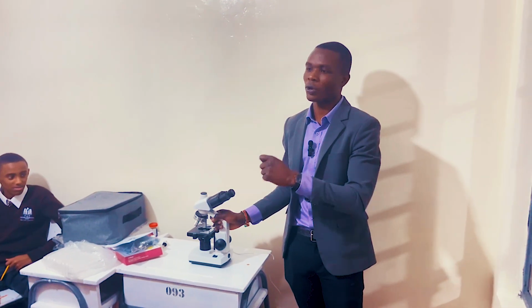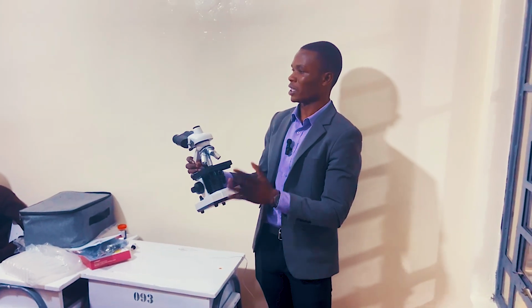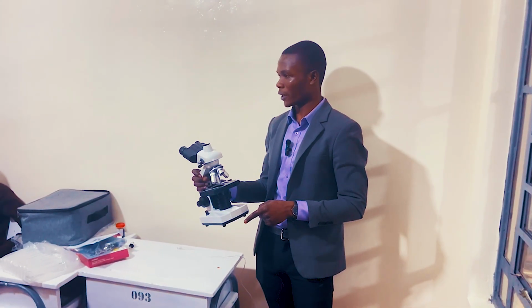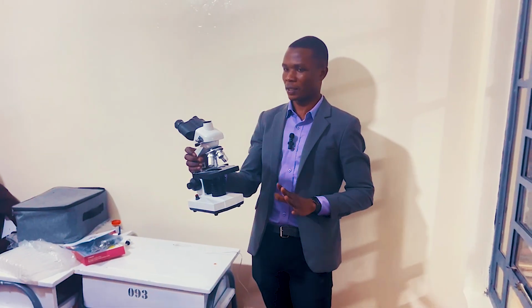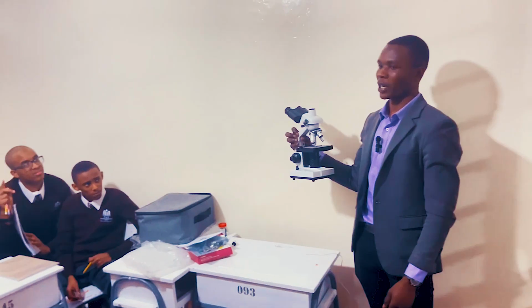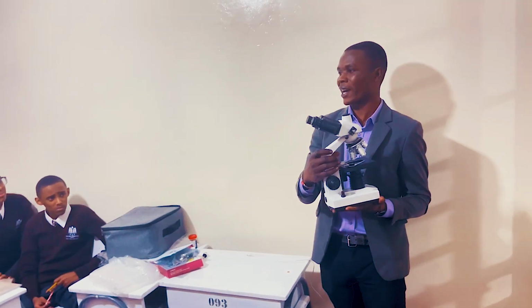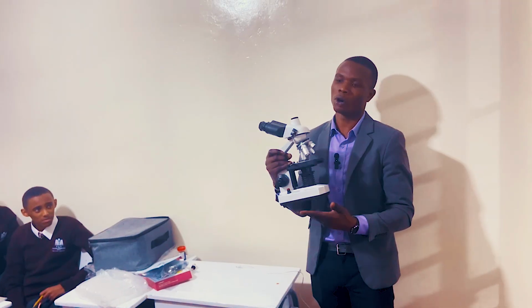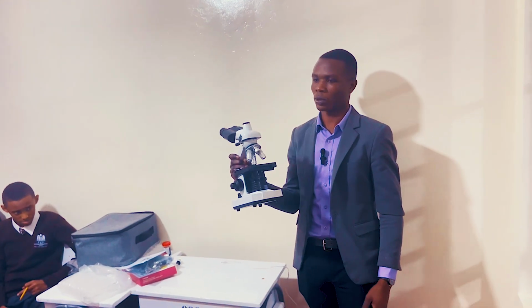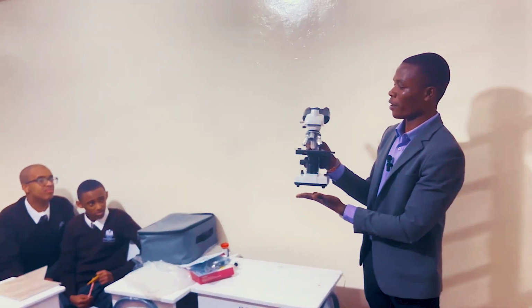Again, we also talked about the parts of the microscope. Unless you know the parts, you cannot be able to use it, right? So if you look at this microscope, it's the same one that's drawn in your books, okay? So we have very many parts here. So let's start with the part I'm holding. How do you call the part I'm holding? Akram? The limb. So the limb is the part that the user of the microscope holds as he or she uses the microscope. How do you call this part, Mulki? The base. This is where the microscope rests.